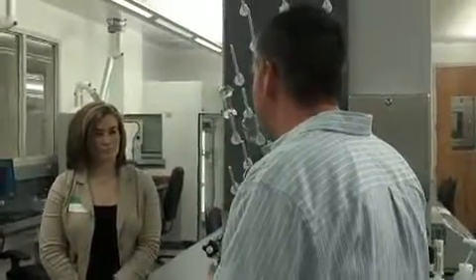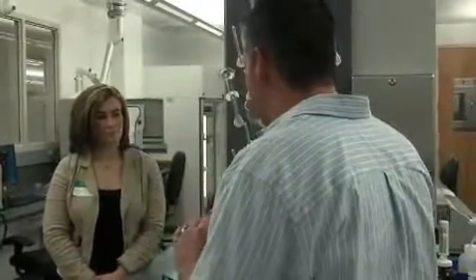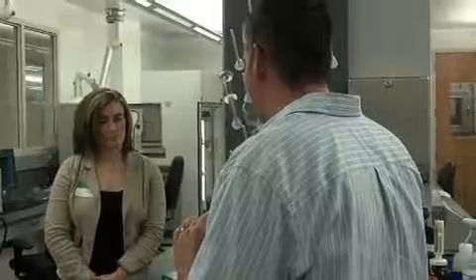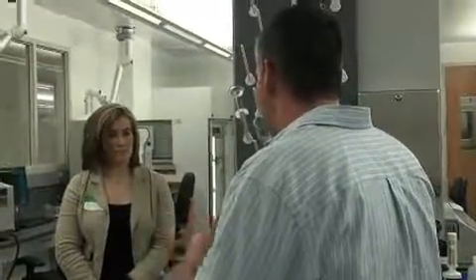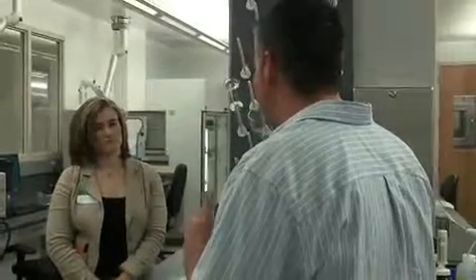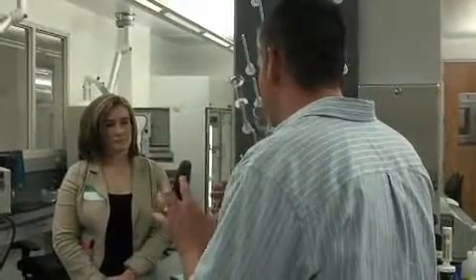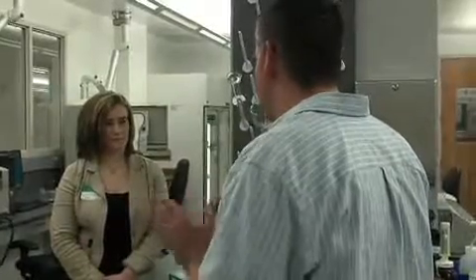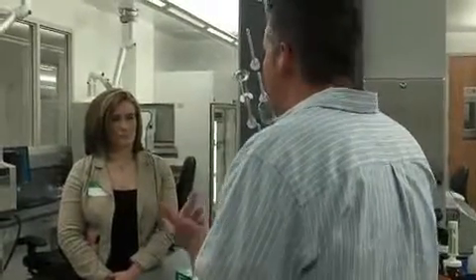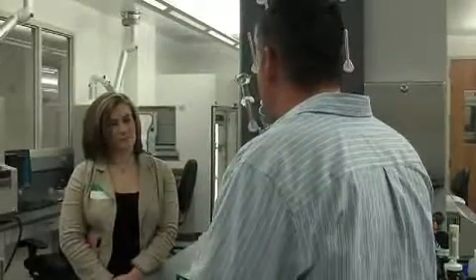So what ends up happening is these instruments actually compare those samples to what's called a size ladder to actually give us a profile. And we usually run a ladder about every 10 samples. Well, in the old lab, with the temperature changes, sometimes you'd have to run that ladder every 2 or 3 samples just to be able to get it close enough to the sample so that they ran about the same amount of time.